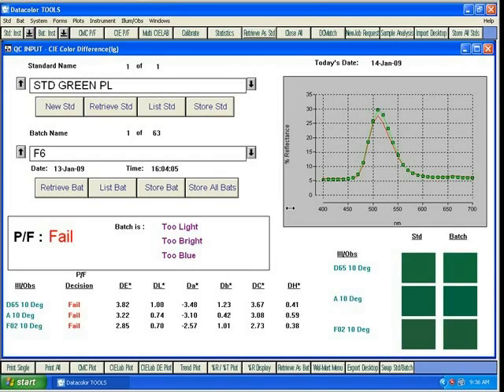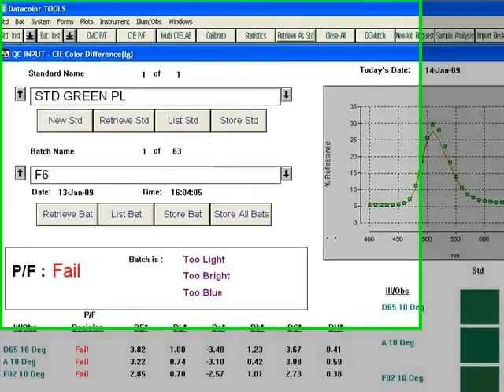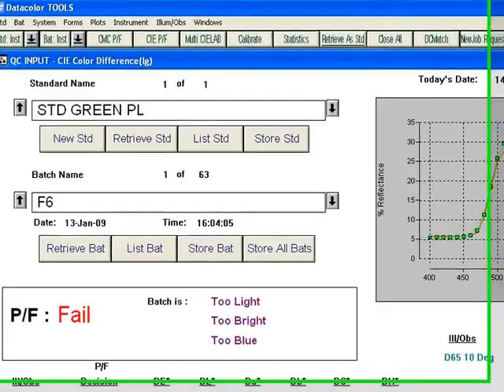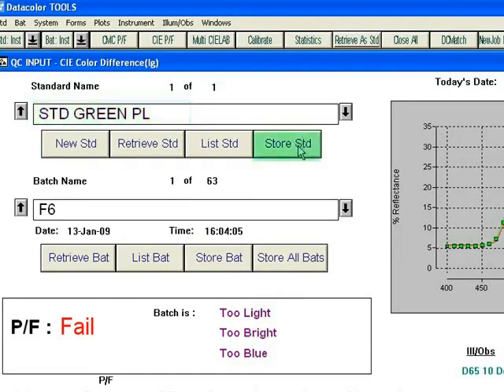To store a standard, you need to make sure the standard is the one showing in the desktop. For example, we will be storing STD Green PL. Once the desired standard is showing, simply press the Store Standard button on the screen.